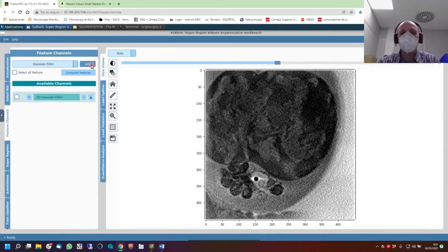Depending on what you want to filter or enhance, you can play with different ones. If you want to go for a nucleus that is big, easy and rounded, you can apply some filters. If you need to go for tiny membranes, you can use another filter. You know what I mean? So it's quite flexible in that case, and you can always come back and forth to create the labels or the masks.